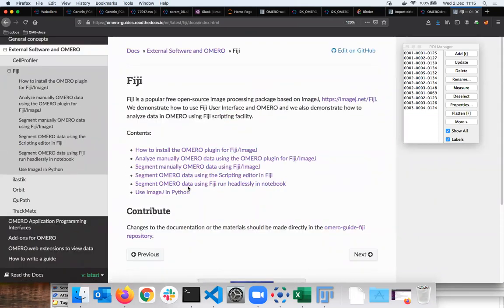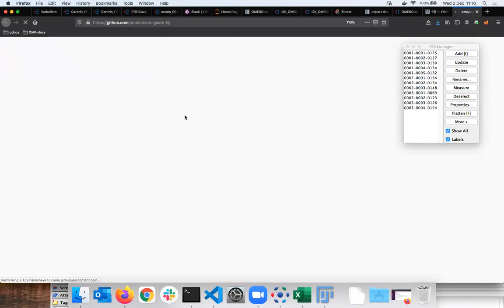and most importantly, you will have access to the repository. In that repository there's a collection of scripts showing how to access the data, basically how to use the API.